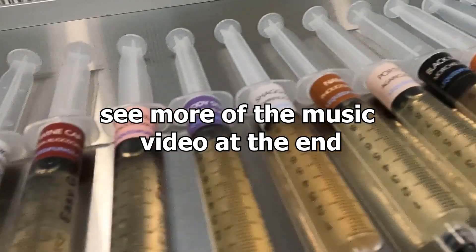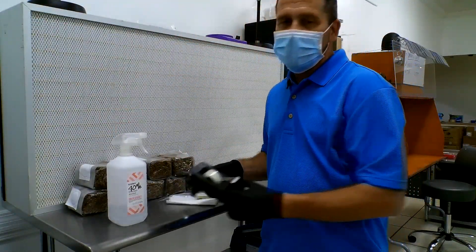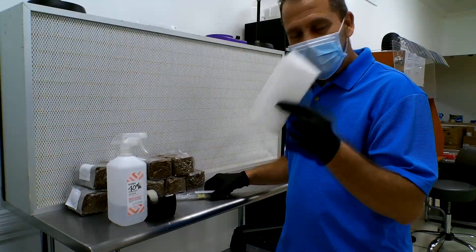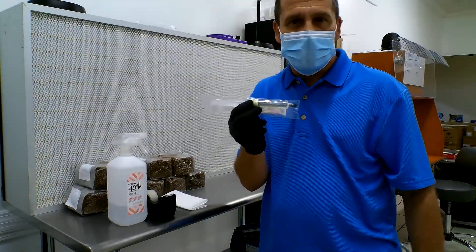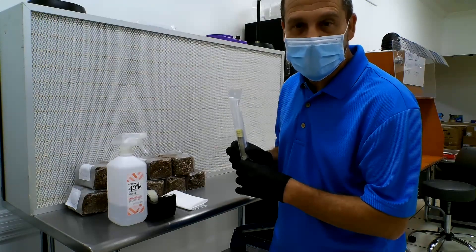The first thing you're going to need is some supplies. You're going to need 70% isopropyl alcohol, you're going to need a roll of tape, you're going to need a paper towel, and you're going to need a Liquid Fungi liquid culture syringe, which can be purchased on our website at liquidfungi.com.